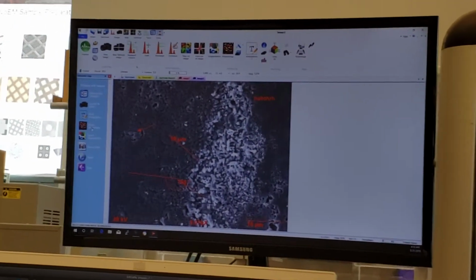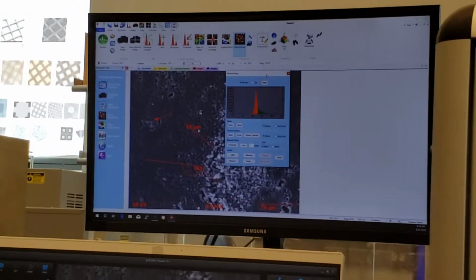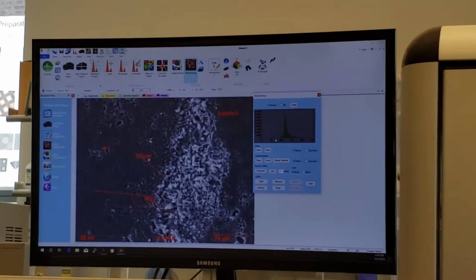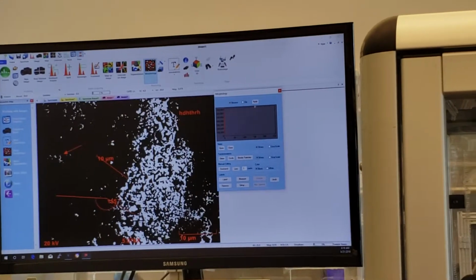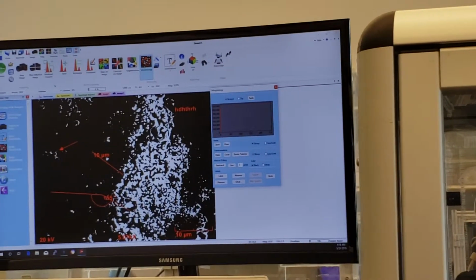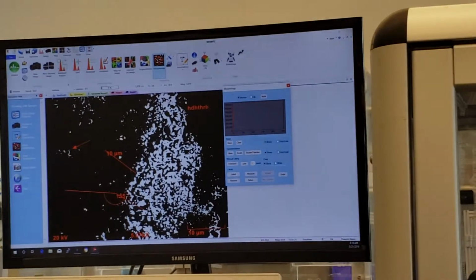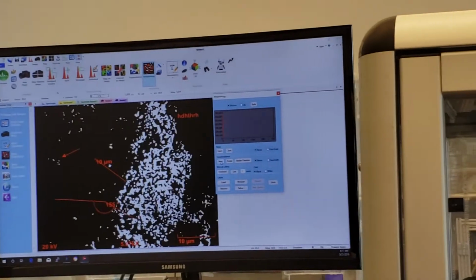The next thing in the flow chart is something called image morphology. And this is a quick and dirty system here. Like I could just move this over. And basically I left click my mouse, I drag to the right, and I color that peak, and I drag the other way as well. And if I go apply, everything it sees in white is going to think it's a particle. This is all up together, so it's hard for it to distinguish, but I can distinguish a couple of these guys out here. So what I could do is erode, just to get rid of any little nonsense, and dilate back again.